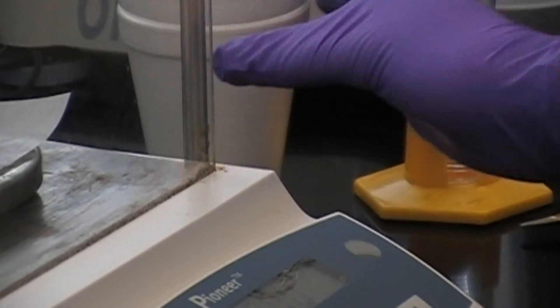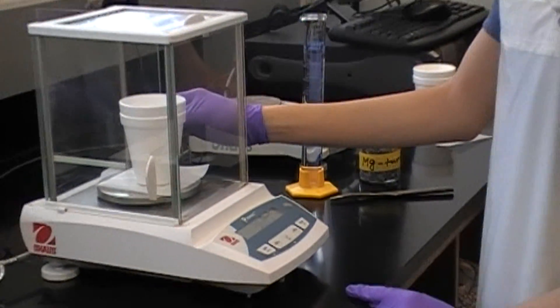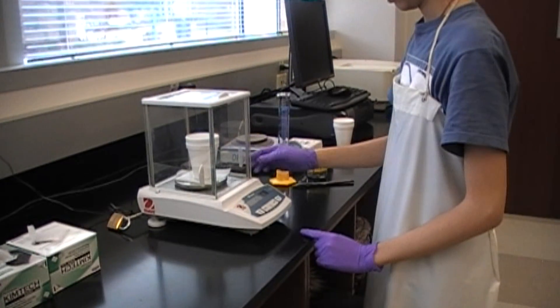To determine the heat of reaction, accurately weigh the dry calorimeter, and add the 50 milliliters of hydrochloric acid to the cup.